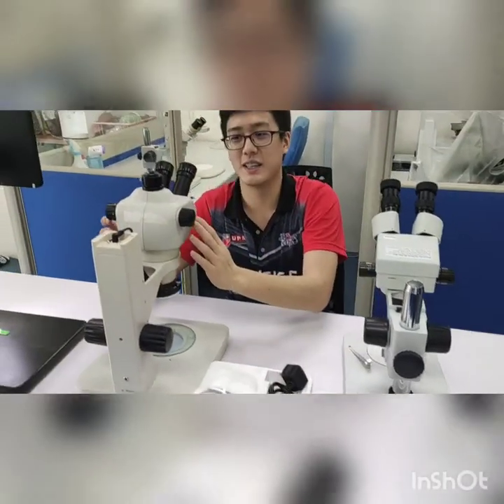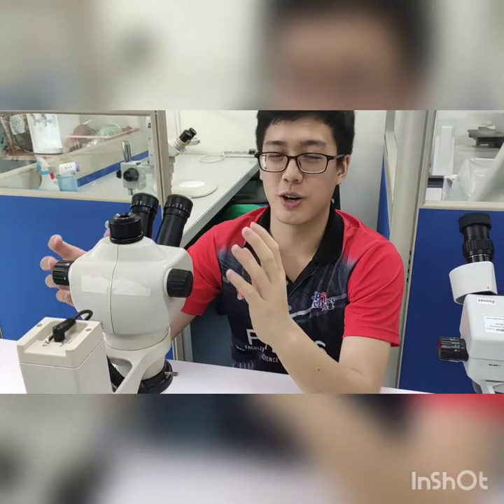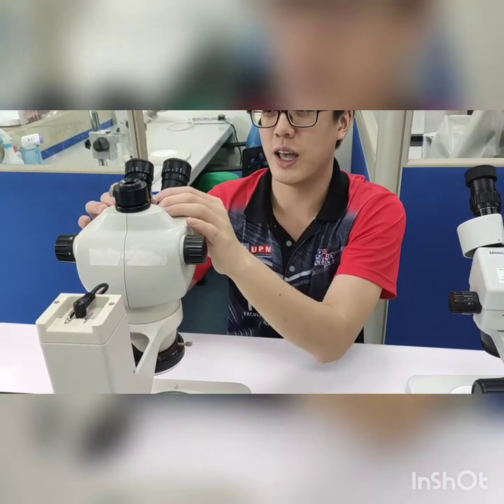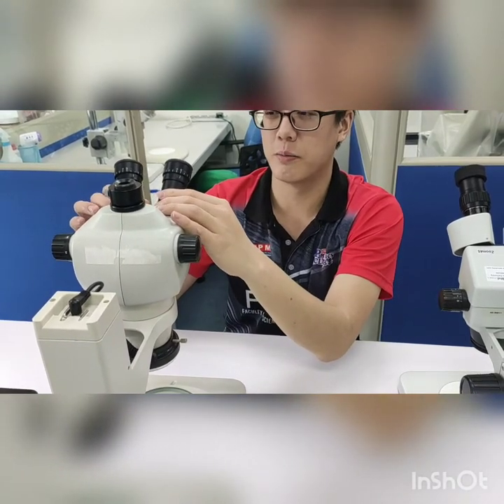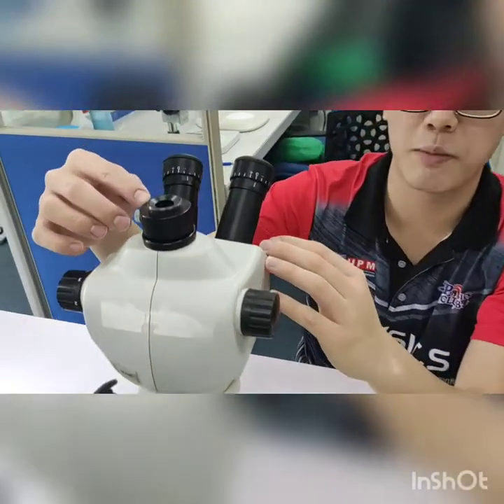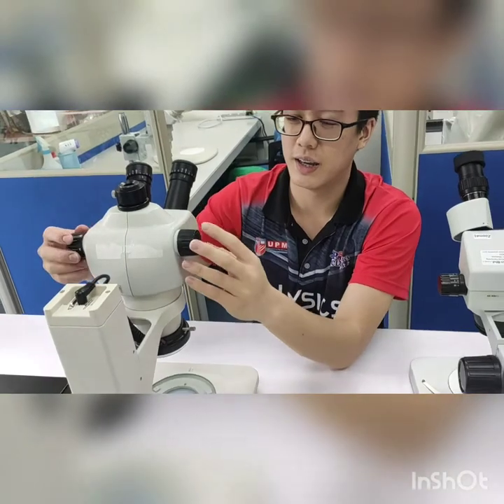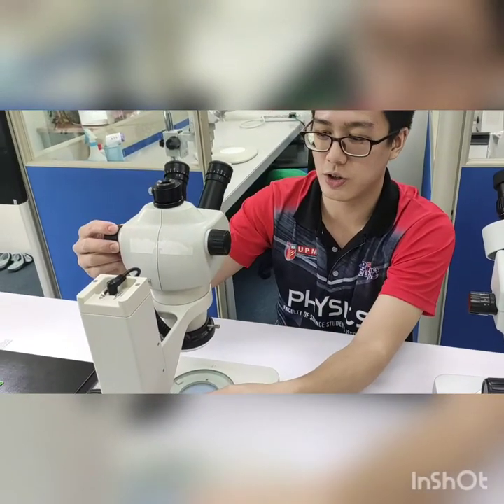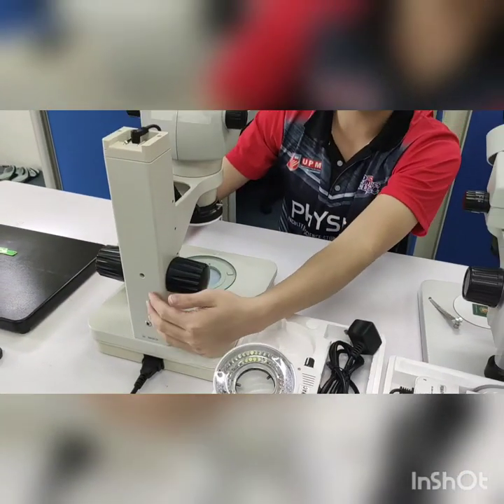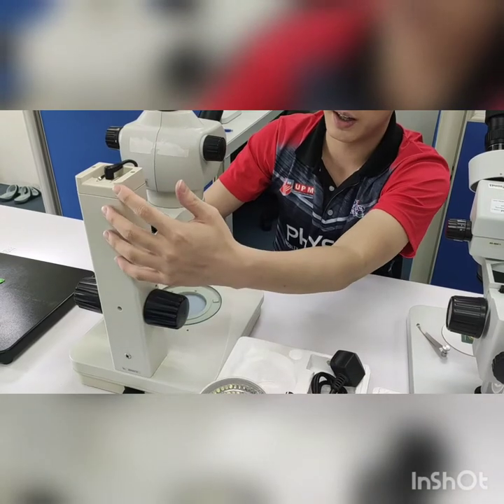Now next, this is the second microscope. It's what we call a trinocular microscope. Other than having the binocular eye tube, we also have an additional camera port. Of course, here we have the same eyepiece, the magnification changer, and the focusing knob. Here this thing is different. This is what we call a track stand, a different kind of stand.